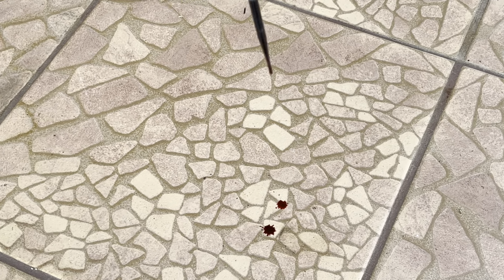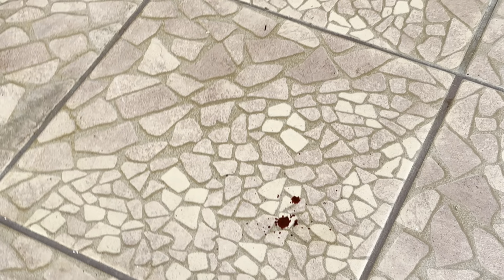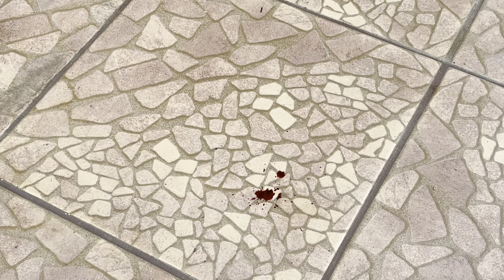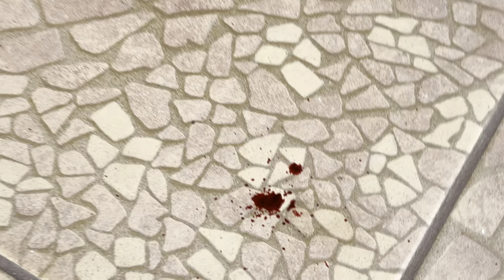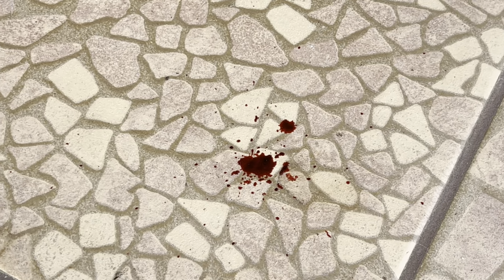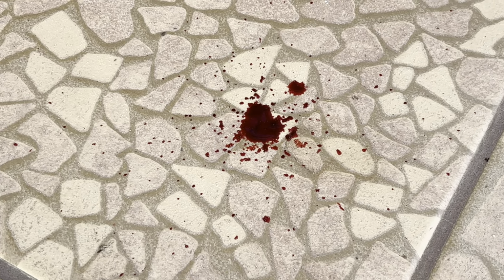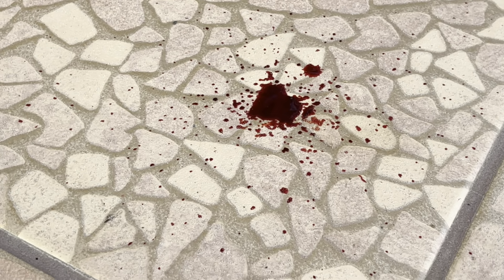So I'm going to make a few blood drip stains here. You notice as each drop hits that other growing blood pool, it creates what is called a blood into blood effect. Those little satellite stains are coming out of that parent stain, and it's creating that interesting and unique pattern that is characteristic to blood falling into other blood. So it's called a blood into blood pattern.